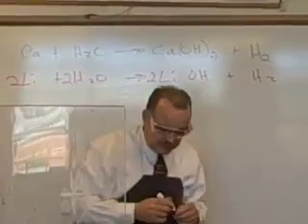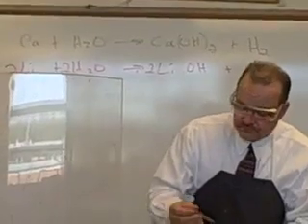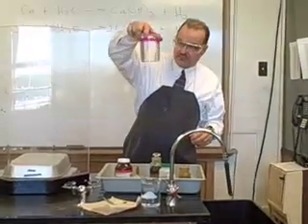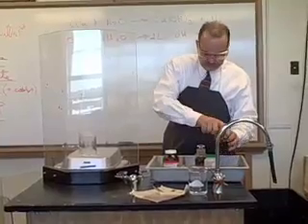Now if lithium hydroxide was produced, what should we see? Pink. You can see that it was making the pink. All right. Okay, sodium.